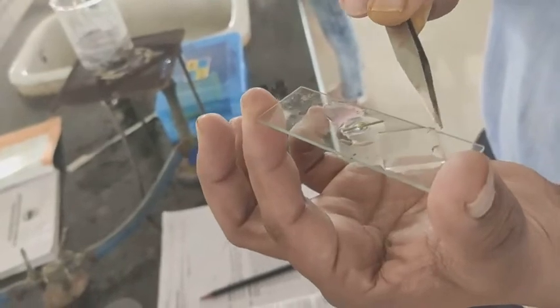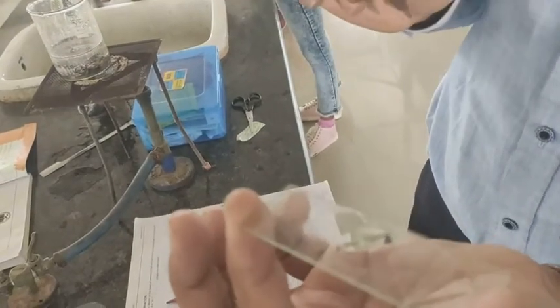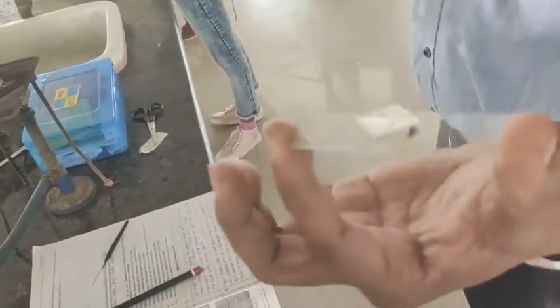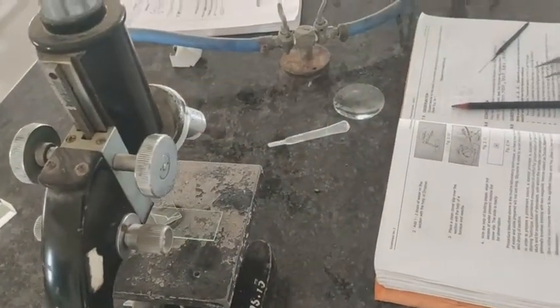Due to the evaporation, you add glycerin. Glycerin does not let the section dry out. This is the main reason, to avoid evaporation and dryness of the slide. This is the routine procedure you can do in experiment number two.